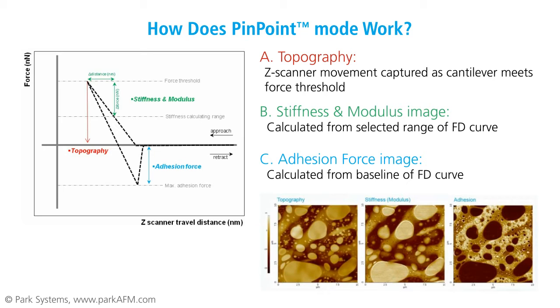In Pinpoint Mode, these data points are collected for each pixel in the imaging area and displayed as an image. The final result is a quantitative mechanical property distribution image of the multi-component polymer.